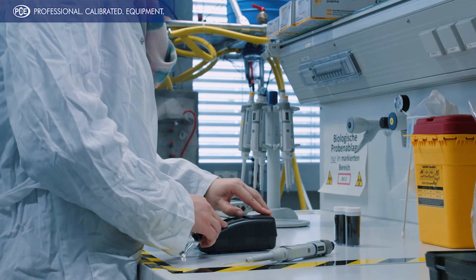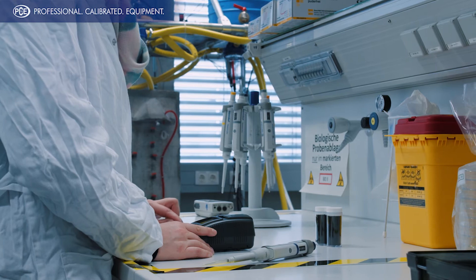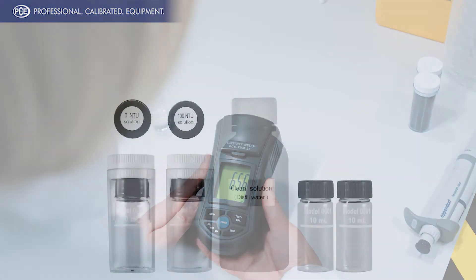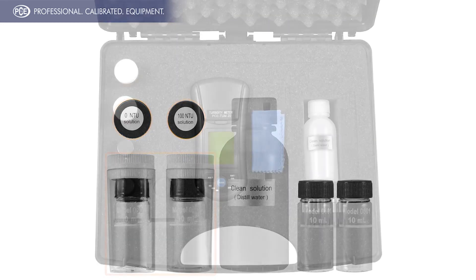The Turbidity measuring device PCE TUM20 fulfills everything required by ISO 7027 standards. With a clear keyboard, it is very easy to use. With the calibrating standards from 0 NTU to 100 NTU, you can calibrate the Turbidity measuring instrument PCE TUM20 at any time.